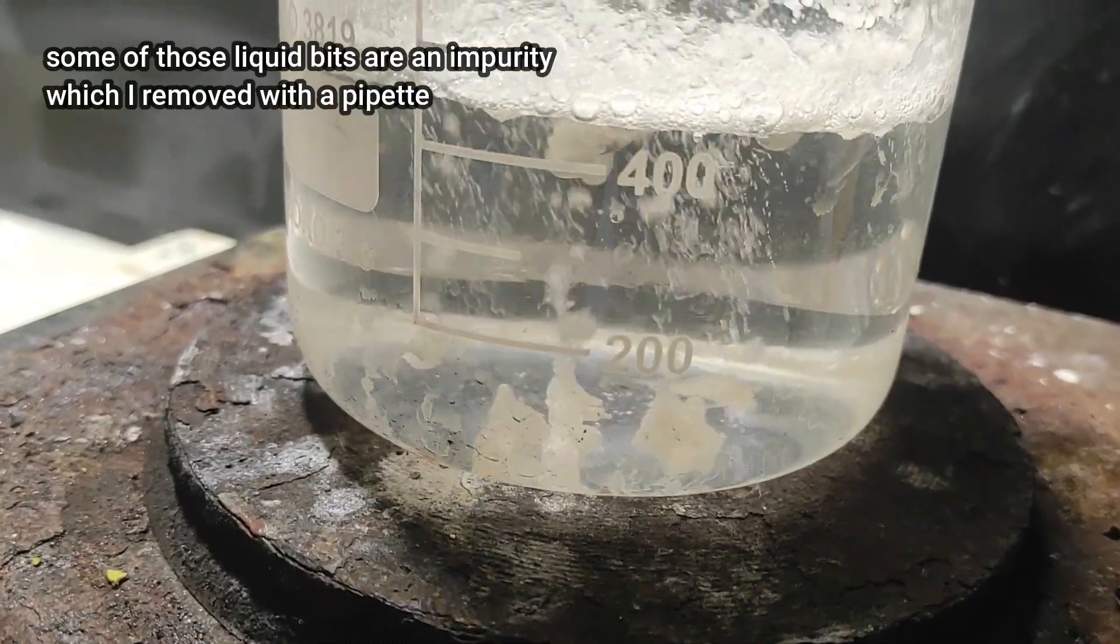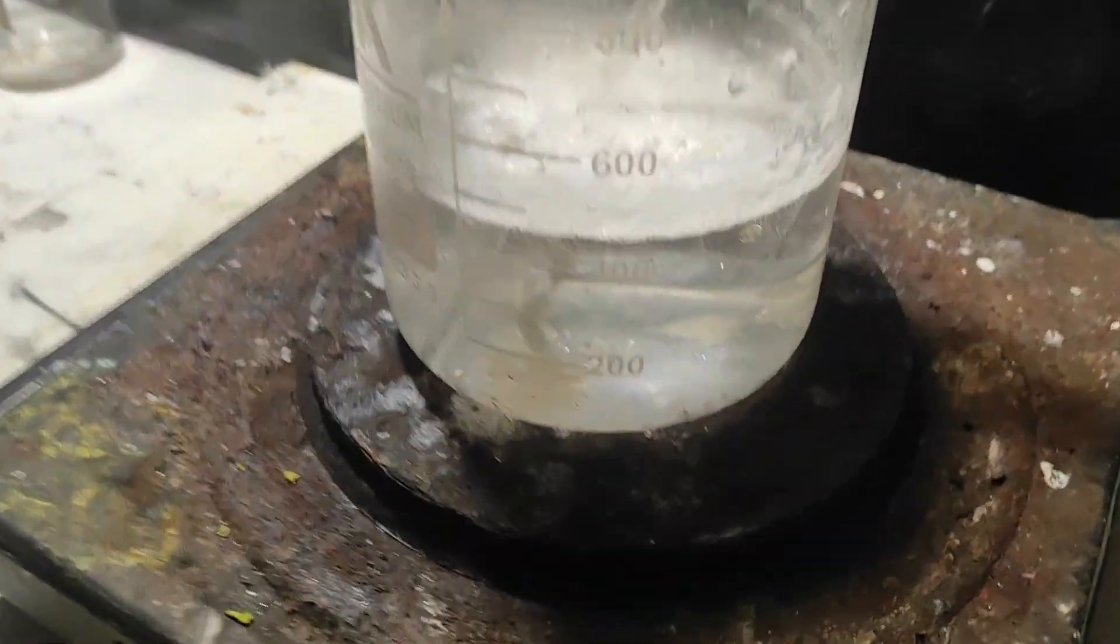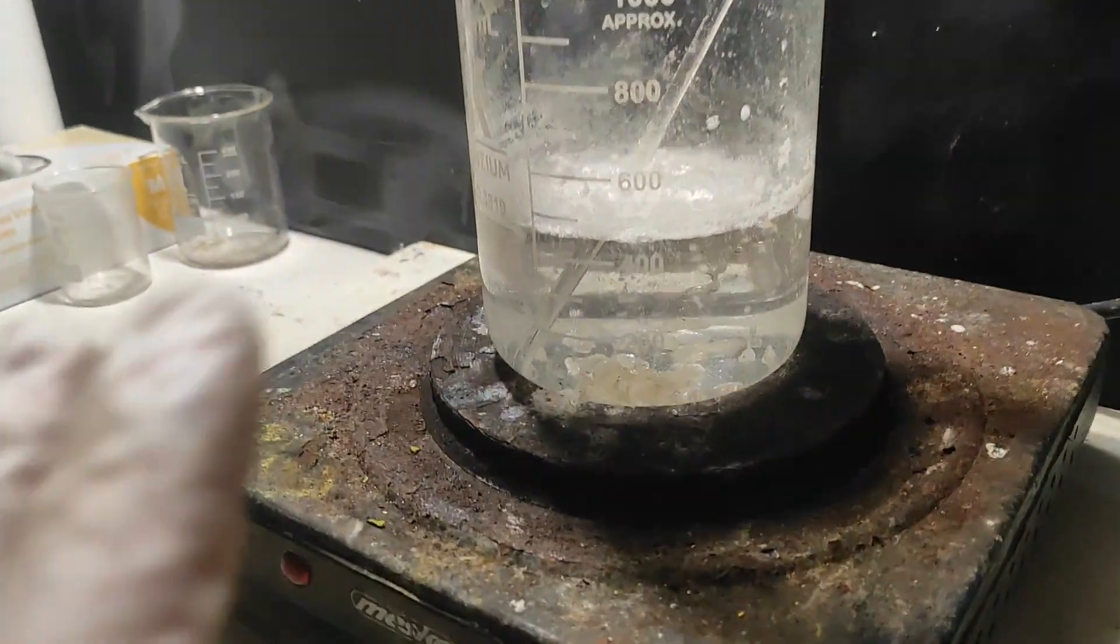You can also test the pH of the solution. If you add too much sodium carbonate, it will turn basic. And if you add it just enough, it should not change color. Now, to recover our sodium benzoate, we just need to boil off all of the water by heating more.